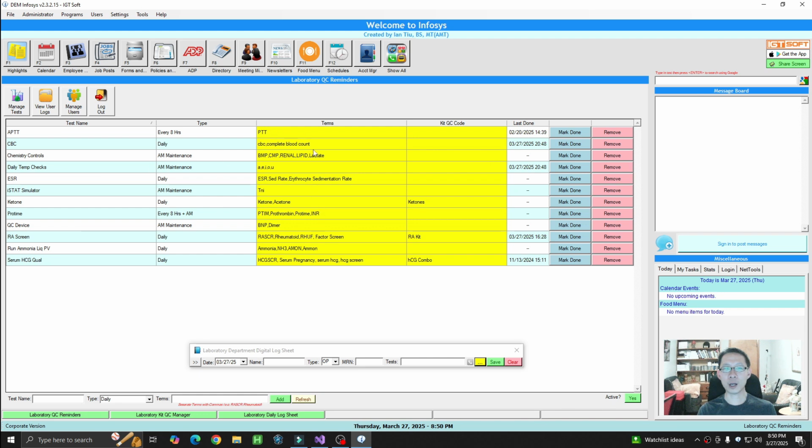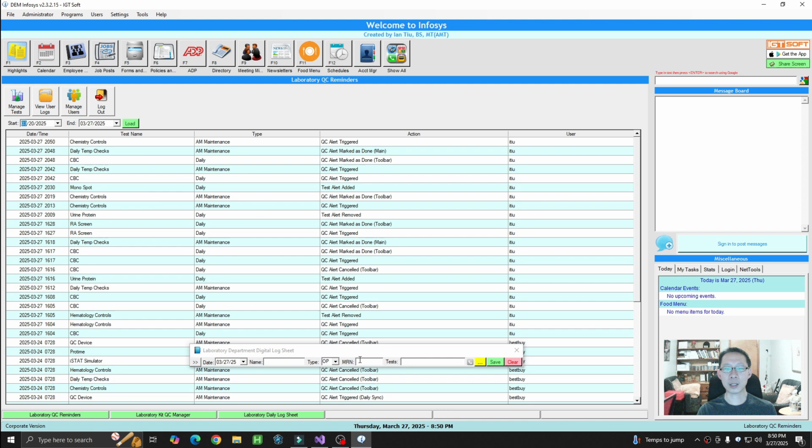And then over here I can put my keywords. These are where the keywords are separated by comma. So if I type in a patient here and then put in, we'll just say, a BMP, since the chemistry wasn't done, let me just try that. We'll just say John Doe had a BMP. So it will show a toolbar very soon. Right now it has a timer. So yep, here it is.